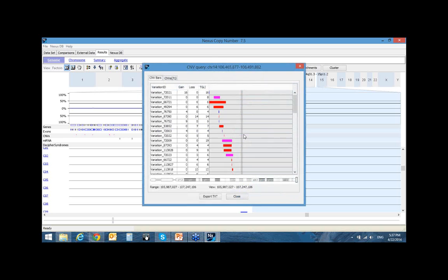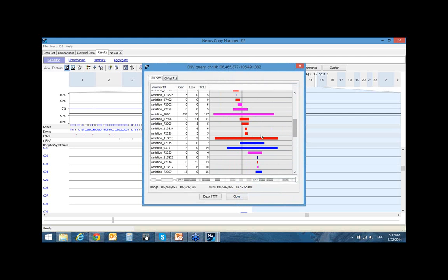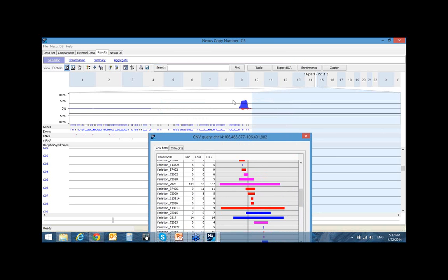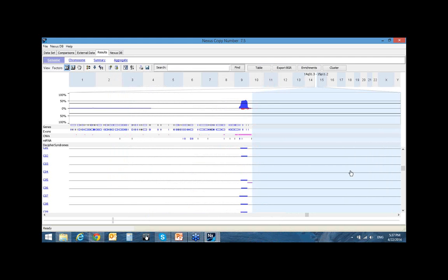If you click it, you actually see a lot of cases have been reported in this region, either gain or loss and gain together in that study. So you have, say, for example, 139 gain, 18 samples show loss, so that overlaps with this. So this tiny gray area is actually what we have here, inside this gain region. So this is another way for you to identify if those gains are really pathogenic or just common human CNV polymorphism. So that's the peak.